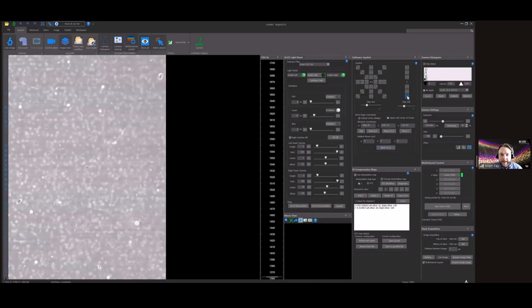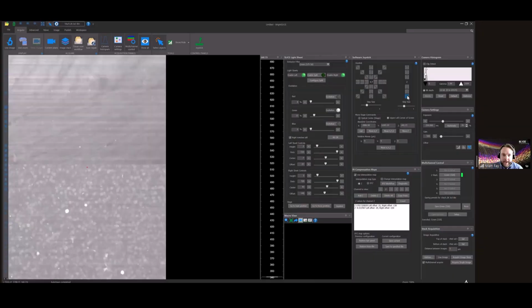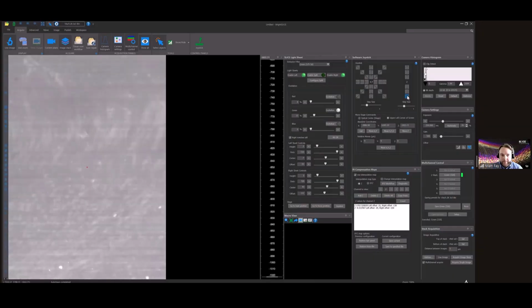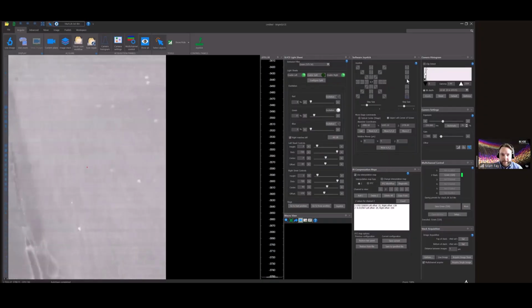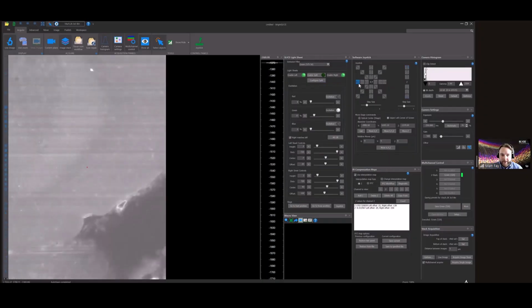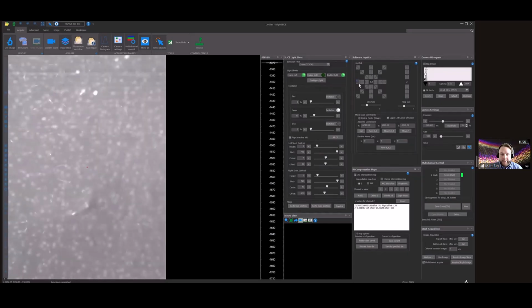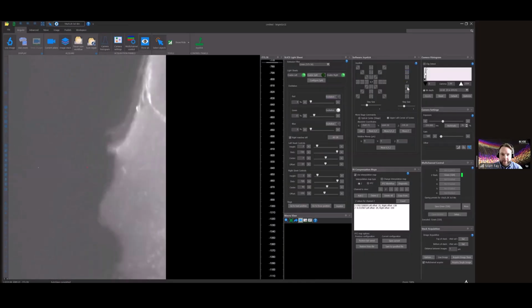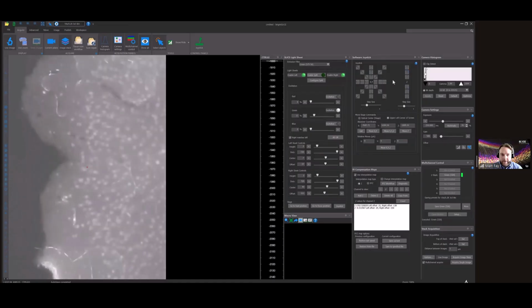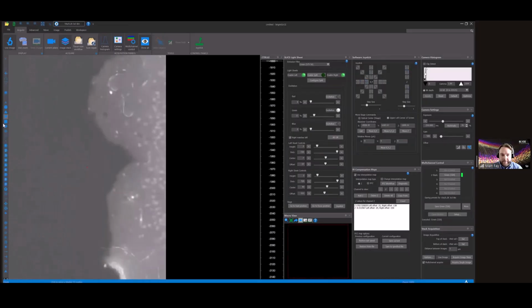Once I have my adaptive RI compensation, I like to navigate around the sample, making sure everything is in focus. This is a great opportunity to place the markers that we have in the BrightSLICE software at the XY extents of our sample, so we can use them later when setting up the acquisition in the workflow. Here I've reached the left edge of the sample, and all I need to do is select a marker from the left toolbar and place it within the imaging environment.